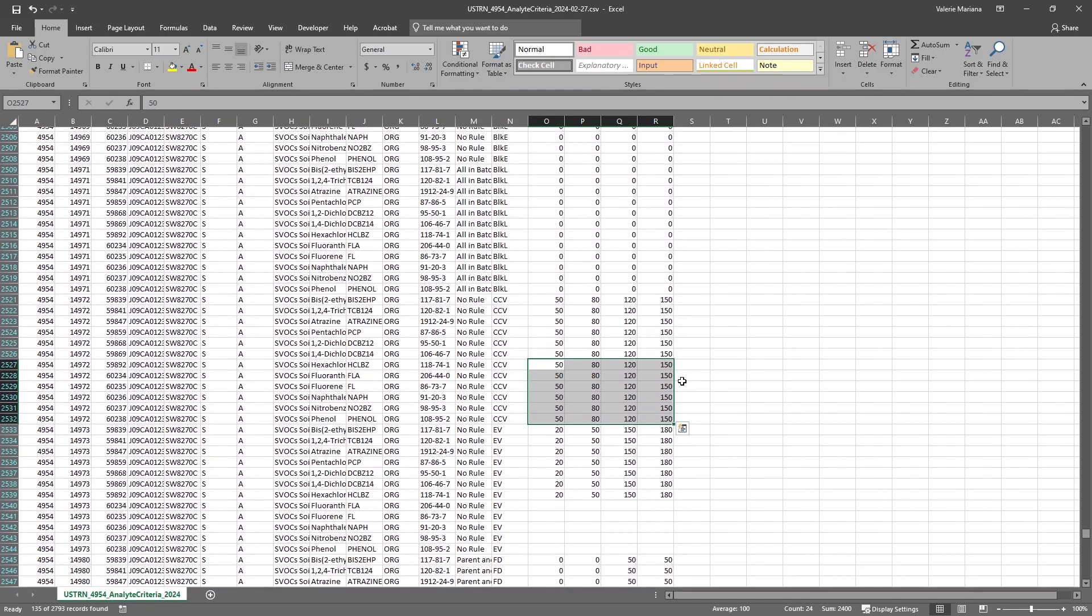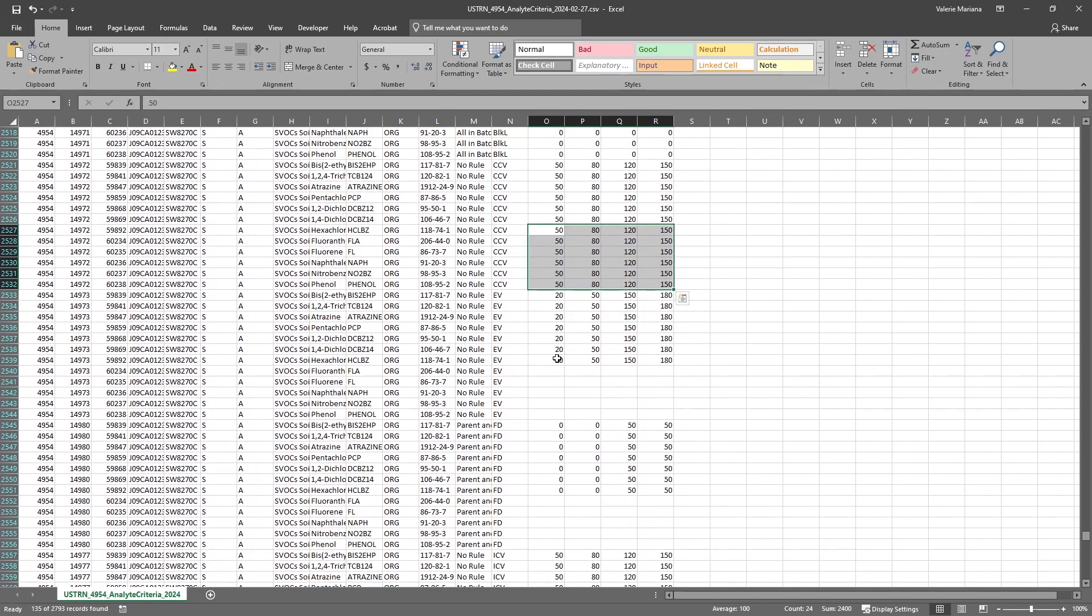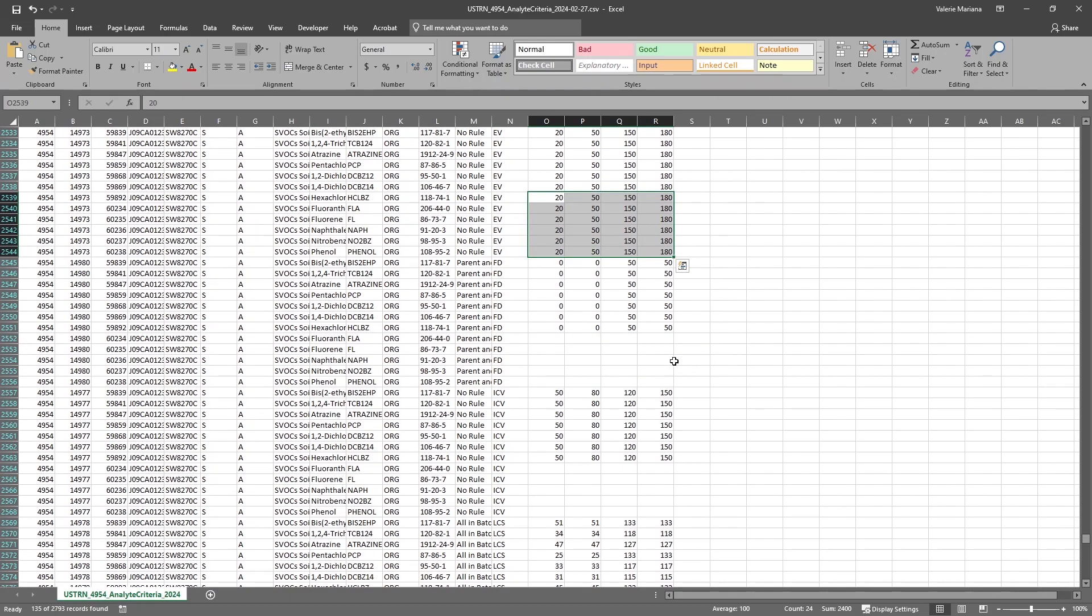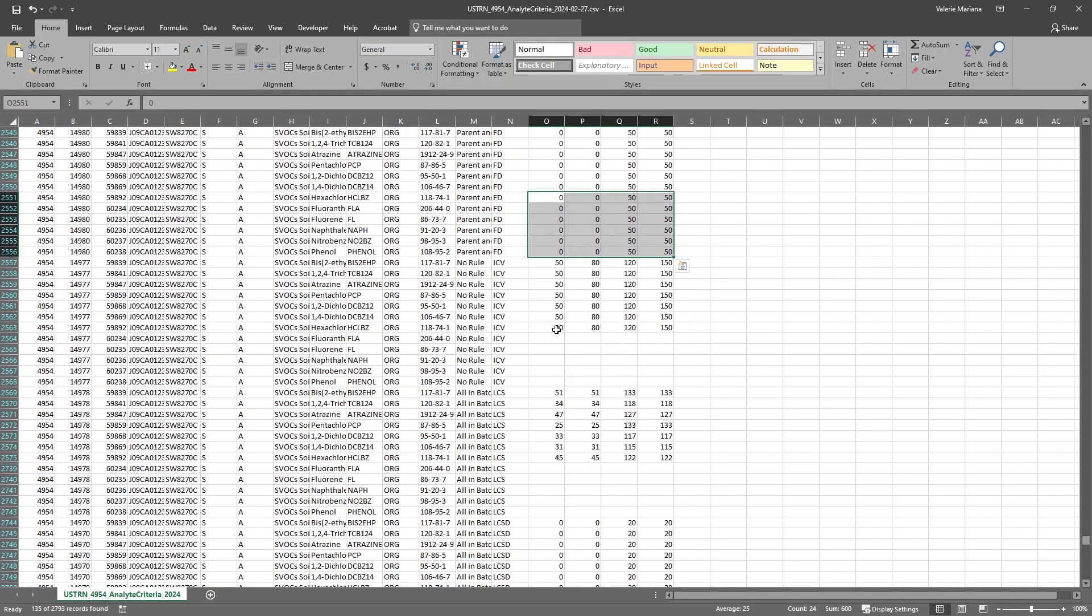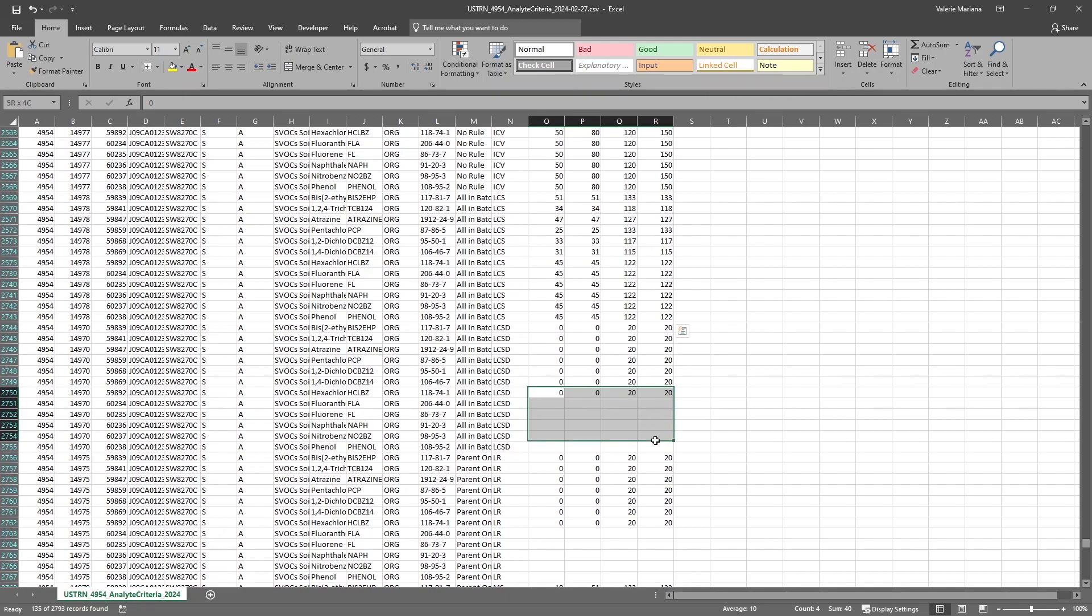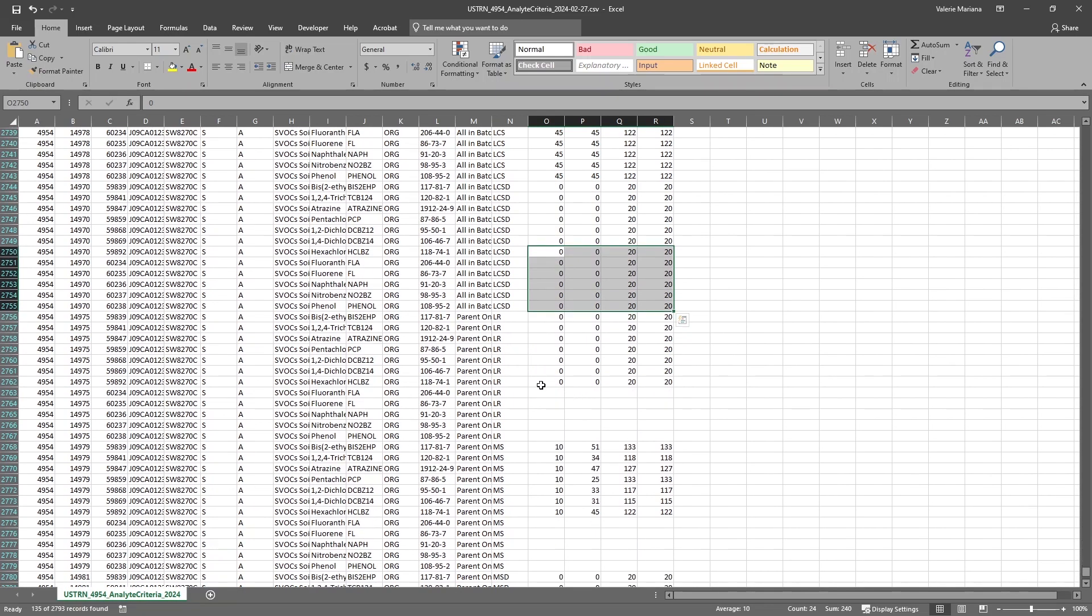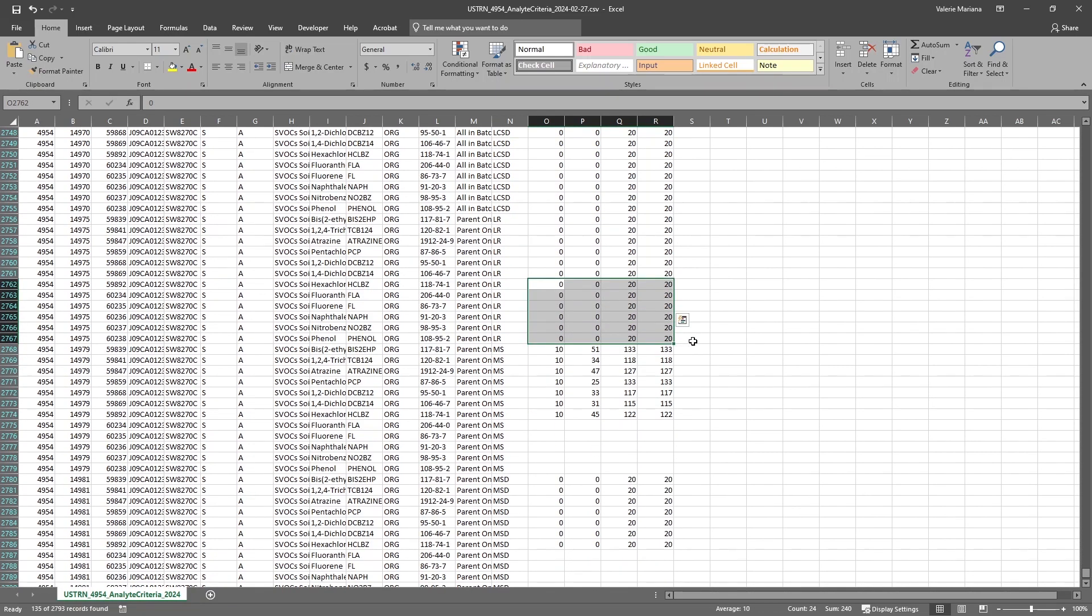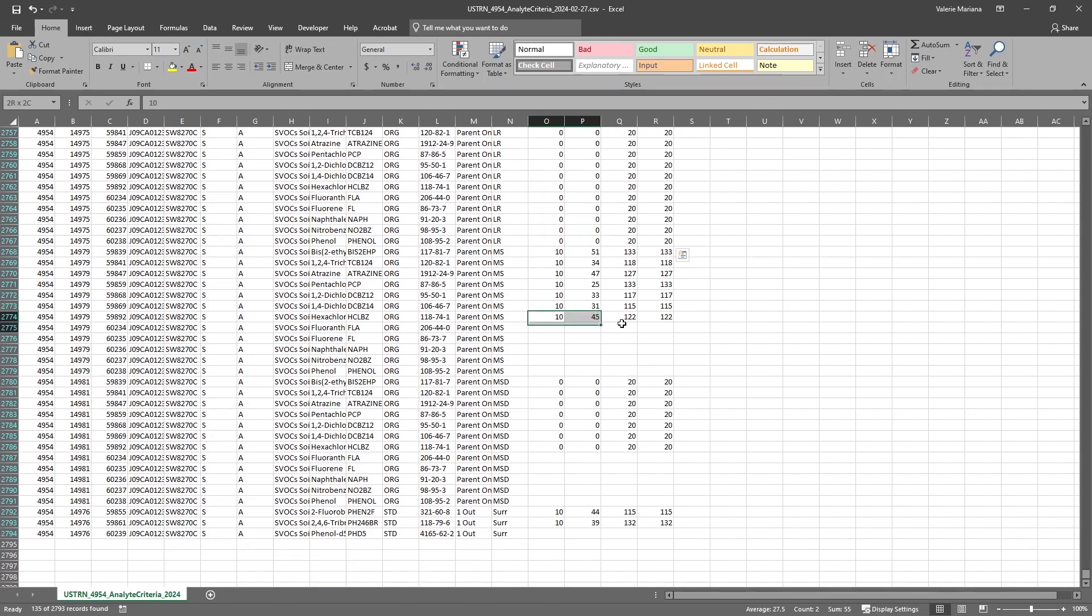We can click and drag to select the last populated row for BLKE along with the blank rows. Then press Ctrl D to downfill the blank rows so they all match. The shortcut helps us fill in the blank rows quickly. We could go back to edit manually as needed. Once we've finished editing, we will save this file as a CSV.